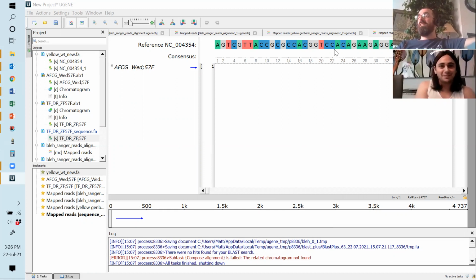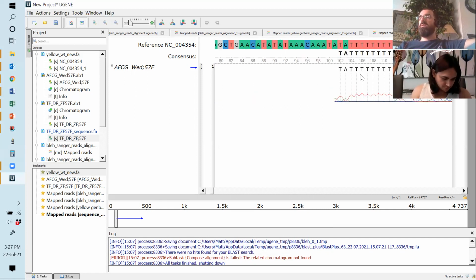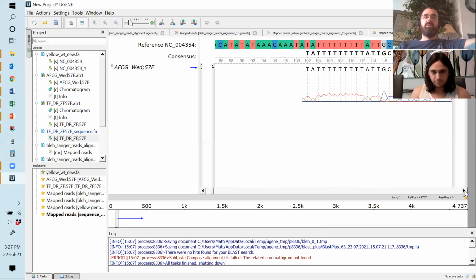So anyway, this is your reference sequence. Now, if you look down, hopefully you should see this box, right, above all that stuff down there, which tells you what you did wrong. And essentially that arrow is telling you where your sequence maps to. So we're going to scroll a little bit to the right, like so, and now you see your sequence pops up. You got that, Dipper? Should be around base 100 or so.